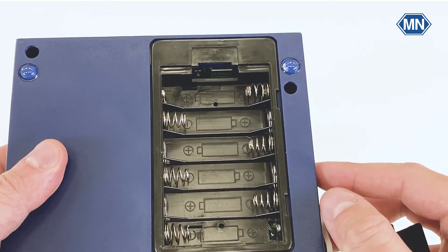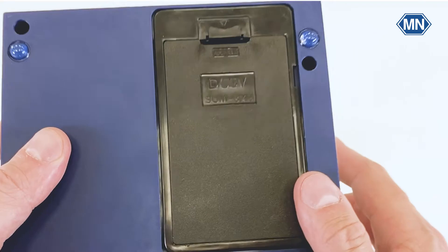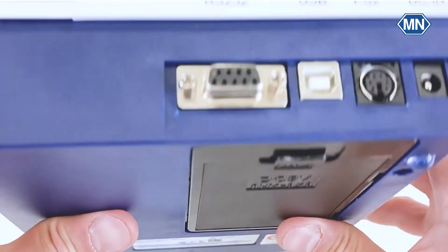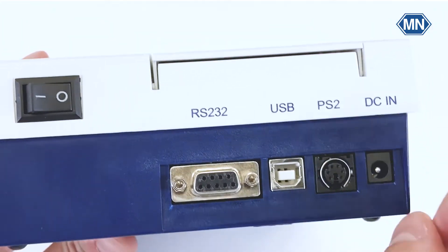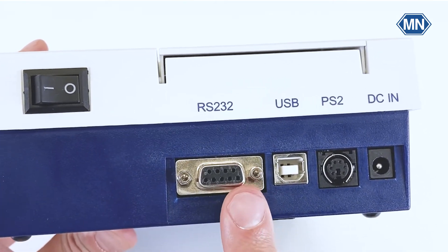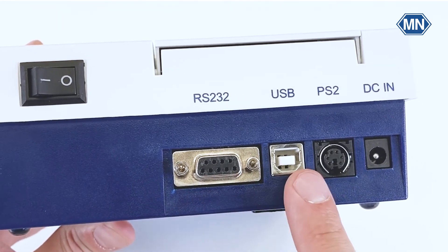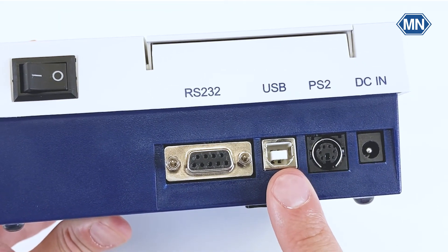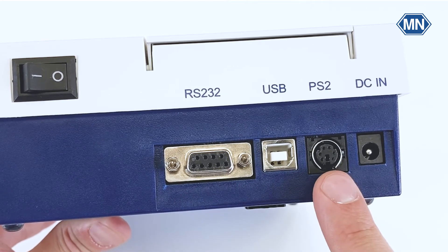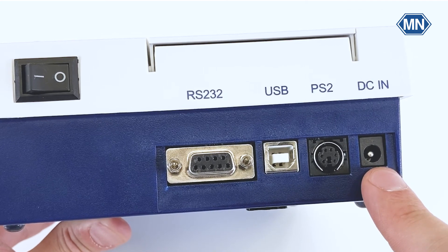Just find the right polarity, insert the batteries, close the compartment, and the photometer is ready for mobile applications. On the back side of the device, you can see the on-off switch, a serial interface for data transfer as well as device updates, a USB-B port also for data transfer, and a PS2 port for the connection of keyboards and barcode readers, as well as the power connection.